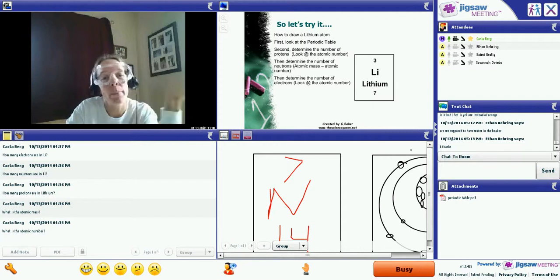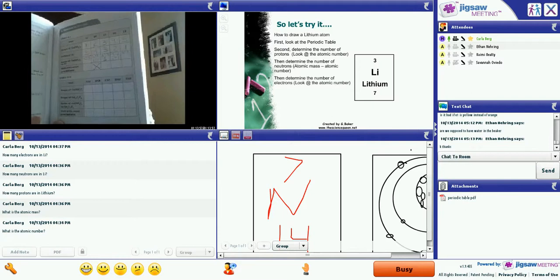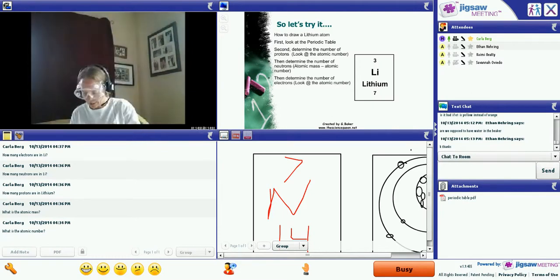Okay, remember, when you're doing a lab, there's not a wrong answer. When you are doing a lab, the answer is what your data shows. Both Cammie and Ethan got the same thing I did. My well with the darkest color is B1. So I have an X in my B1 box.